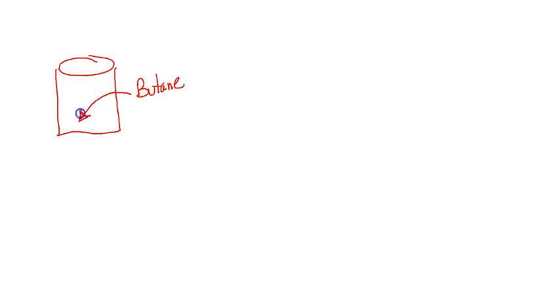So what I'm doing today is I'm going over the butane lab, and this lab, what we had is a canister of butane, and that canister of butane was basically a refillable canister. And in this canister of butane, it said it was quadruple refined, okay, which means that this container had butane gas of very high percentage. Now, when they talk about refined or talk about quadruple refined, basically what they're saying is that this butane should be at a high concentration.